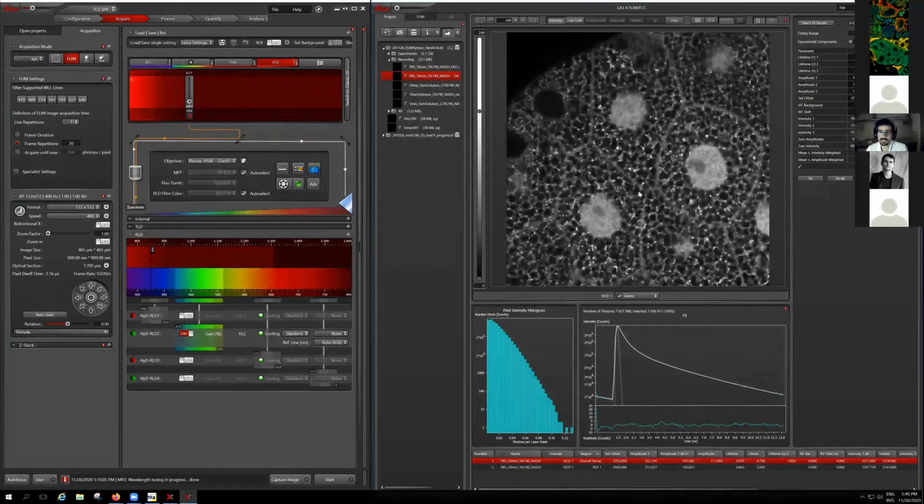What might be the reason? The reason is that we are also considering the nuclei, which have non-metabolically active NADH in them, and that has a different lifetime. I don't know what that lifetime is or in which direction it's contributing. But for the actual analysis, I need to discard the nuclei in my field of view and do the analysis outside the nuclei, only in the cytosol. So that's one thing. Chi-square is one.